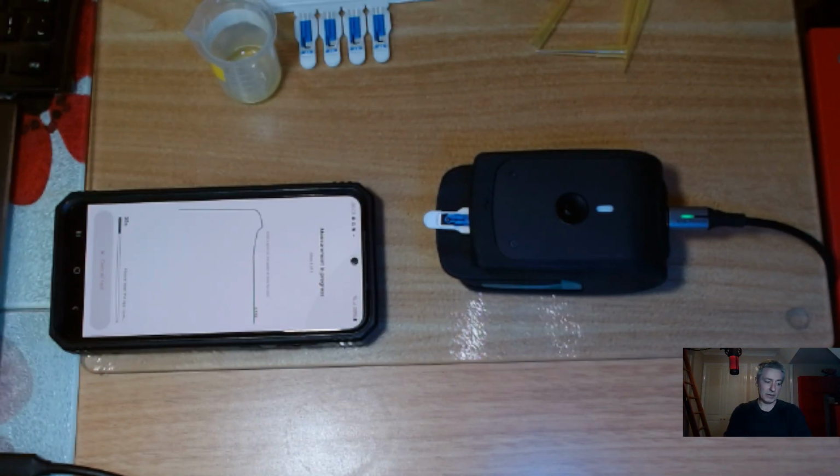But I realized that when you pick up a screen printed electrode, you've really no idea of the history of that electrode. So it's probably not a bad idea to have a cleaning routine or protocol in place. And that's what I'm just going to do now. It'll be finished in a few more seconds.